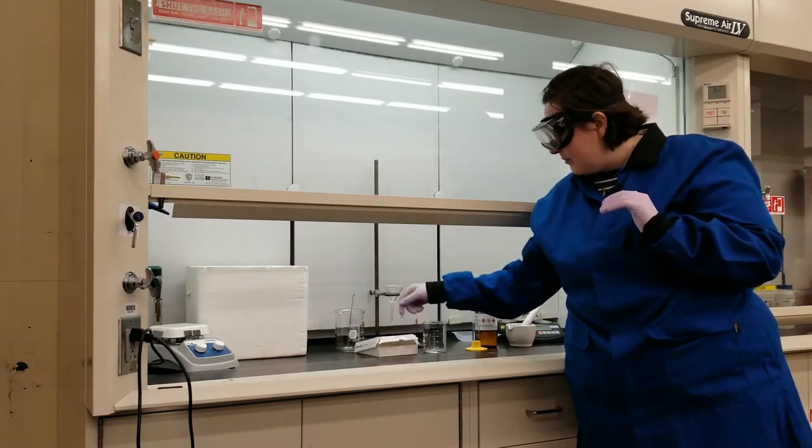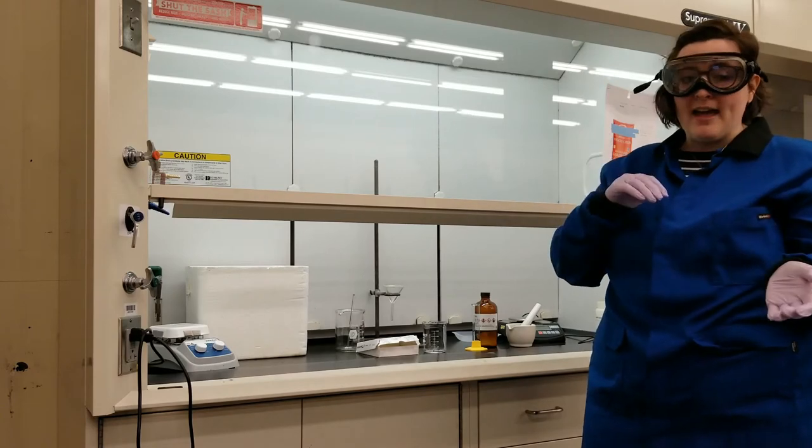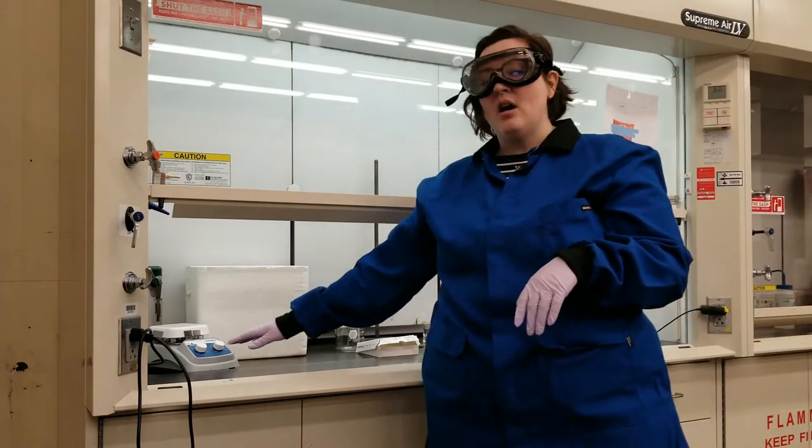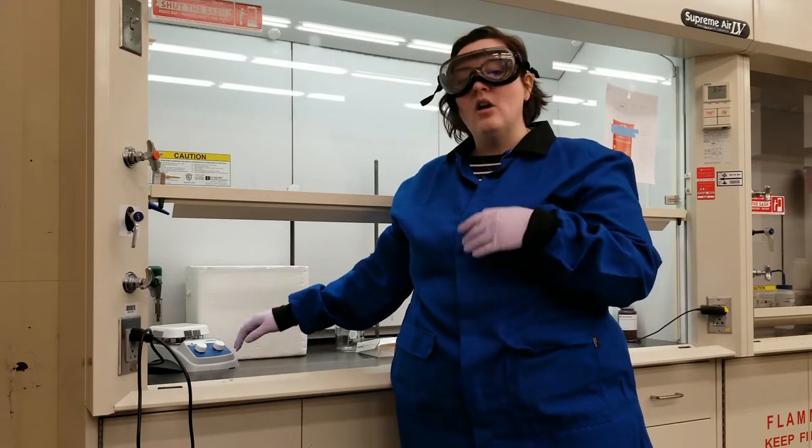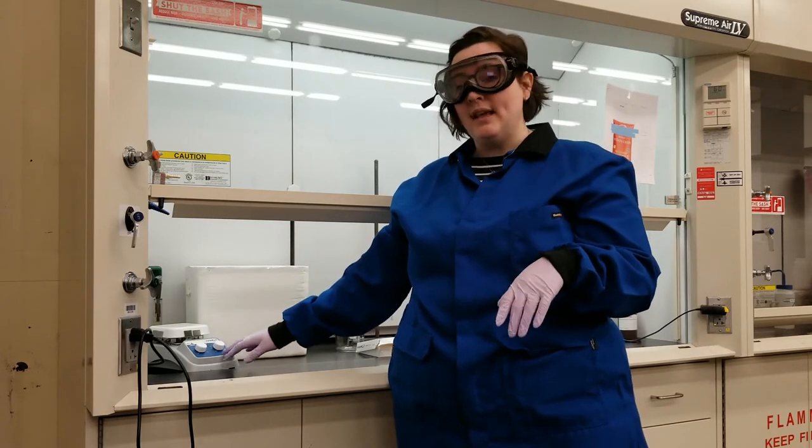Then I'm going to want a way to separate my dissolved fats from my solvent, which is going to be a hot plate. I'm going to gently heat the hexane on the hot plate until all the hexane evaporates off, and I'm just left with my fats.